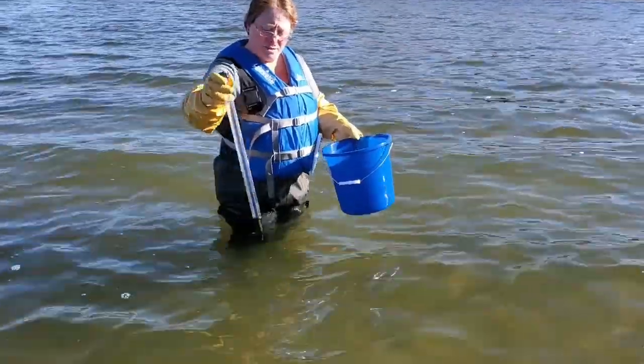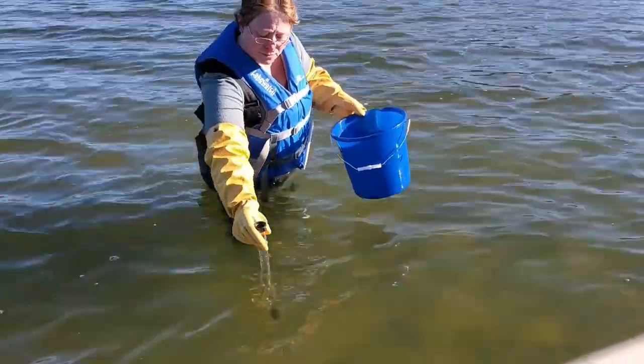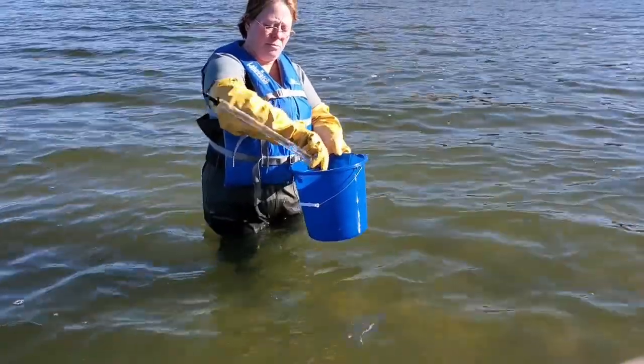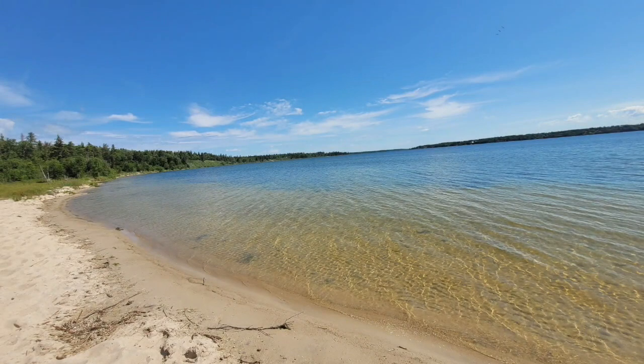Using the wine thief, collect water samples from 5 locations along the beach at knee depth and another 5 at mid-thigh depth. This will amount to 10 total samples from the wine thief deposited into the pail. You want the 5 locations to cover the entire length of the swimming area, ensuring consistency from week to week.